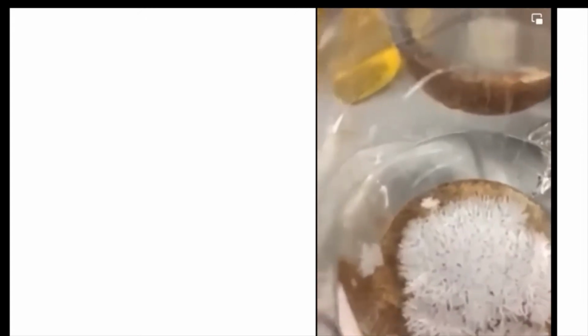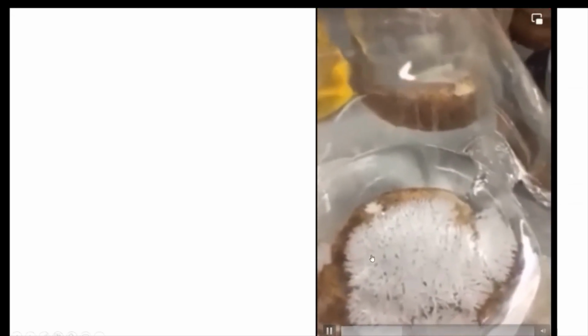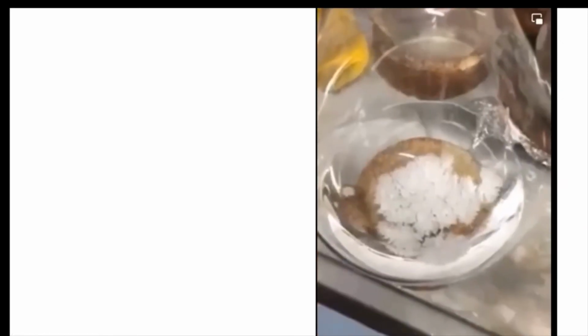Normally non-polar or slightly polar compounds can be easily recrystallized from acetonitrile. Sometimes you may add 1 to 2 milliliters of DCM in acetonitrile and leave it overnight. You will get this kind of crystal. Sometimes leave it in the refrigerator, you might get the crystal again.